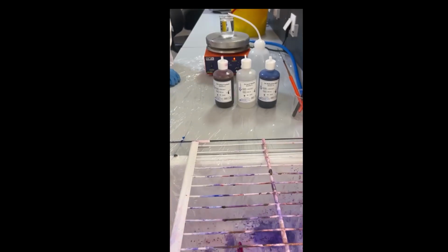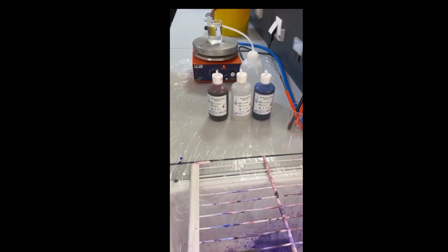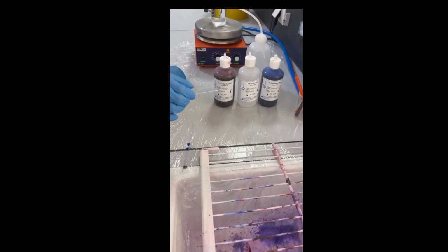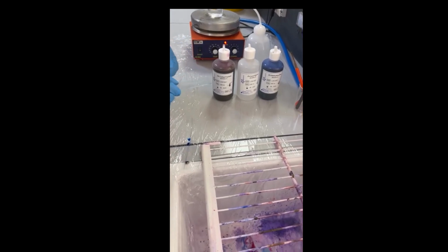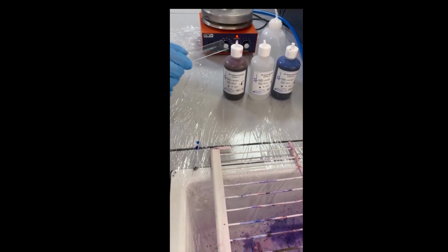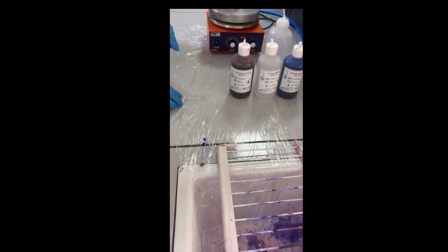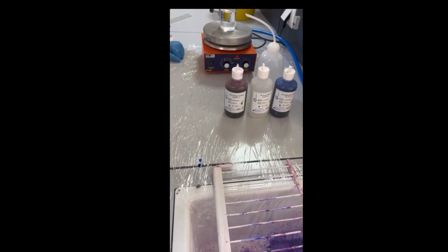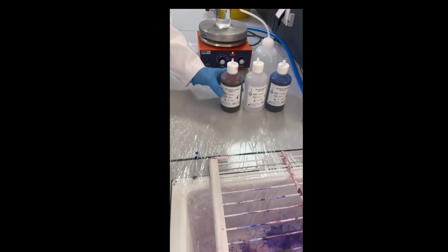The procedure of the acid-fast stain. After I prepare the smear, you know how to prepare the smear. It's spreading the bacteria on a clean slide, allowing it to air dry, then fixation, and allowing it to cool. Then I will do the procedure of the acid-fast stain. The primary stain is carbol fuchsin.